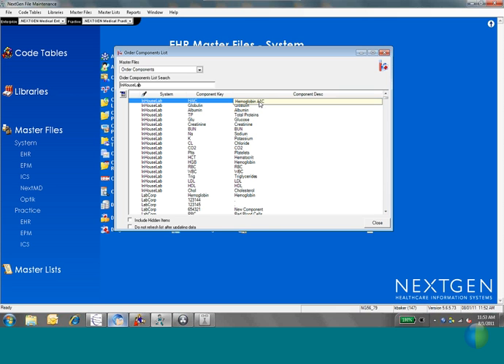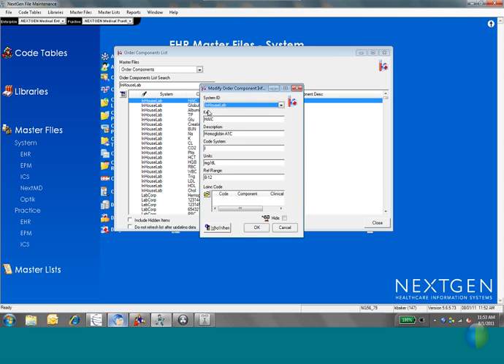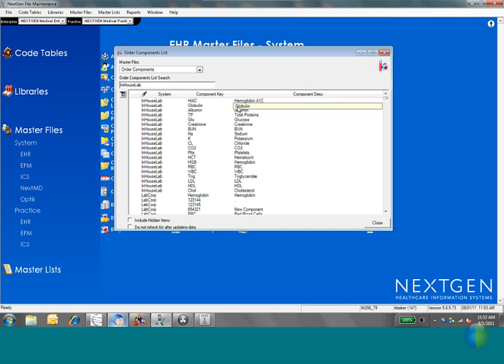But basically, when you create your component, it's looking for the same system that you chose in the test, which is in-house lab, a key and a description, which you make up for yourself, and code system, which is I for in-house. And then it's a good idea to have the units of the test and the reference range for the normal values. So if it's normal from 0 to 7, for example, then you would want to put that in your reference range.